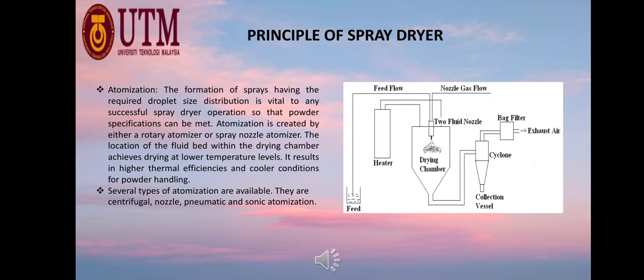We move to the next atomization, which is the pneumatic atomization. This is the third most common method used primarily in smaller drying systems, which is also known as the two fluid pneumatic atomization process. Here, the atomization is accomplished by interaction of the liquid with a second fluid.